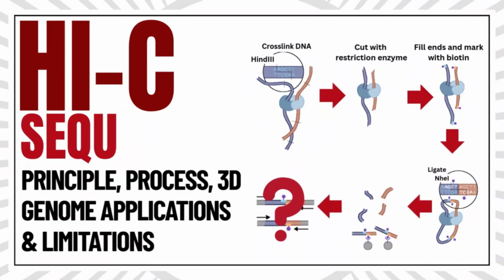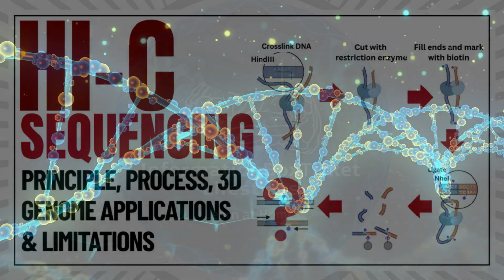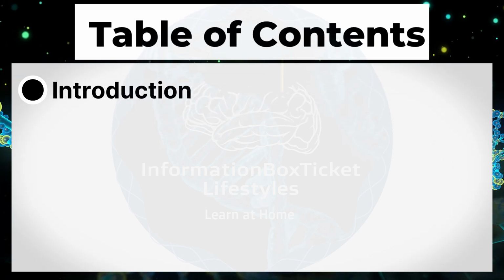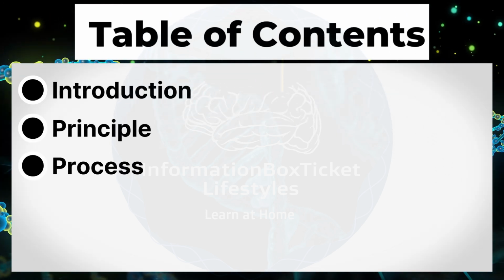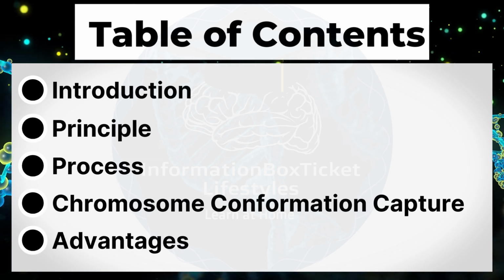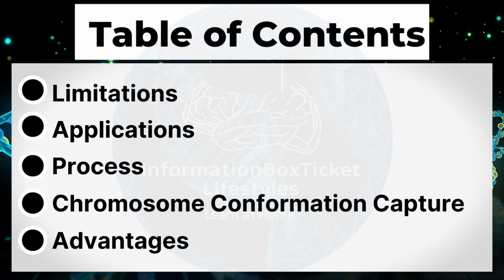Hi-C sequencing: principle, process, 3D genome, applications and limitations. Table of contents: introduction, principle, process, chromosome conformation capture, advantages, limitations, applications.